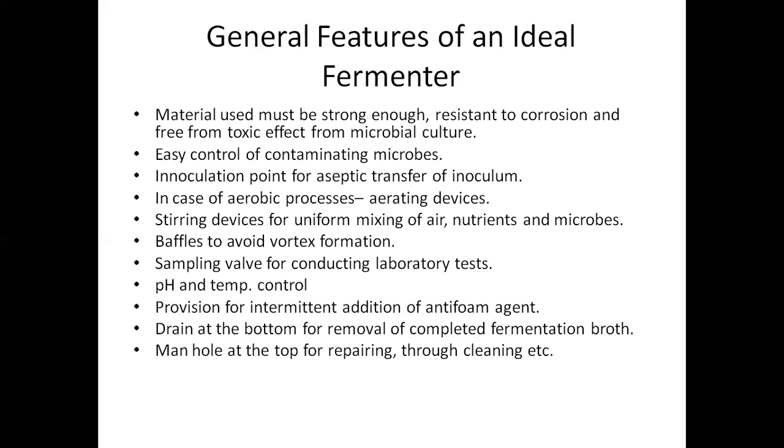In case of aerobic processes where oxygen is required, there have to be aerating devices, and also there should be a provision for stirring devices, that is for the uniform mixing of air, nutrients as well as the microbes. There are things known as baffles, which are rectangular plates attached to the walls of the fermenter, and they avoid the formation of a vortex. There should also be a sampling valve for conducting laboratory tests.